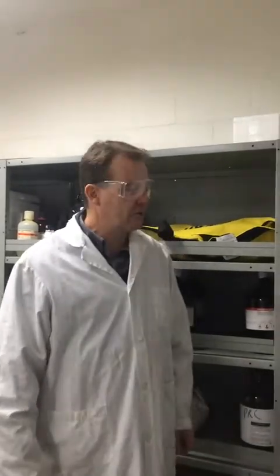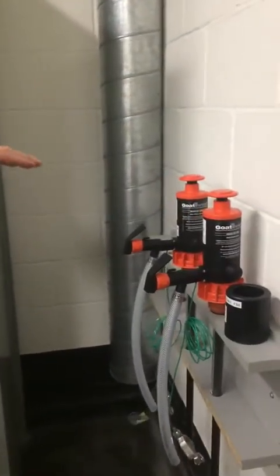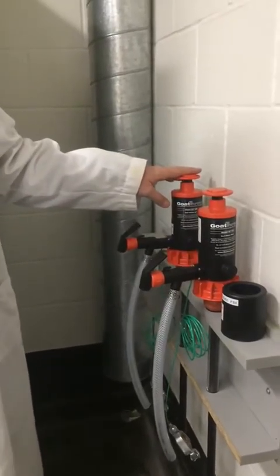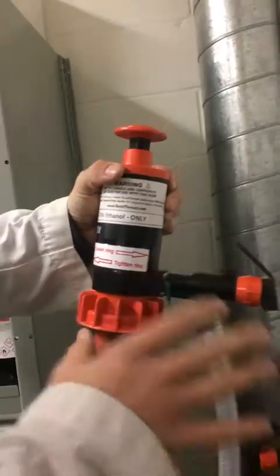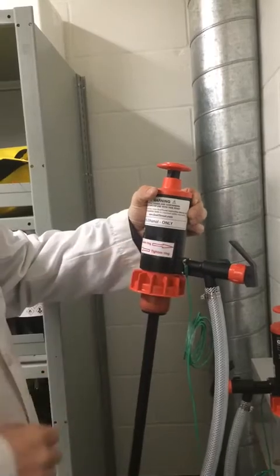This is a tutorial on how to use the flammable liquids dispensing pumps in the flammable liquids storage room at the Life Science Centre. You'll notice behind the door there are two pumps — one is rated for 95% ethanol, the other for 100% ethanol. It's written right on the pump itself. It's really important that you only use a pump for the designated purity of your ethanol to prevent cross-contamination.